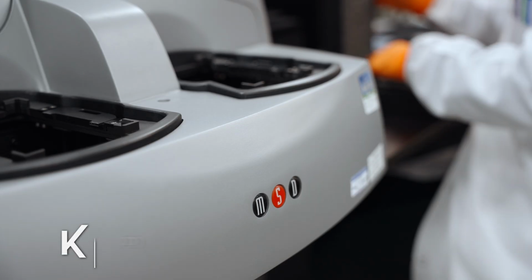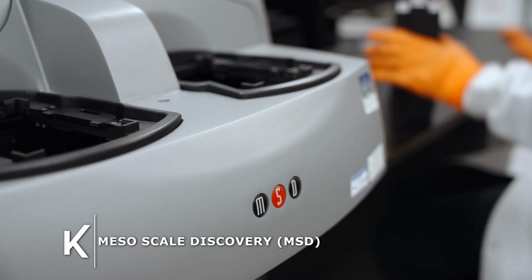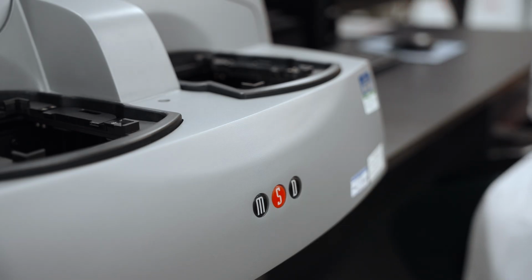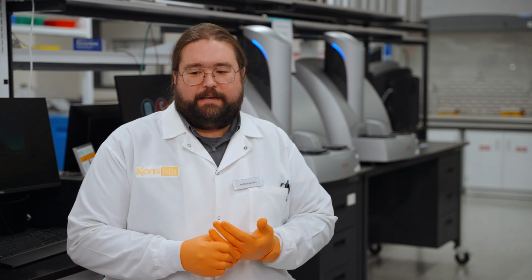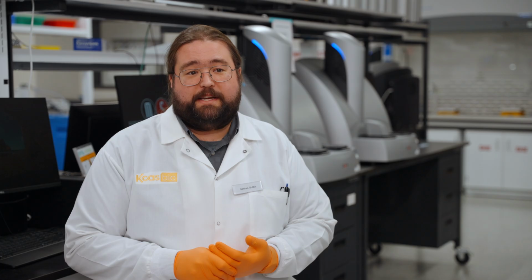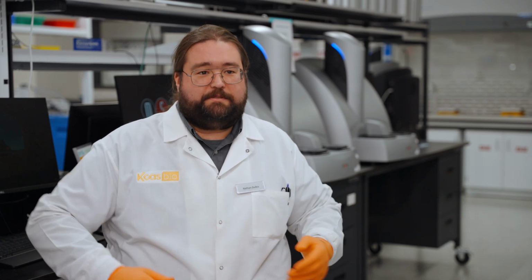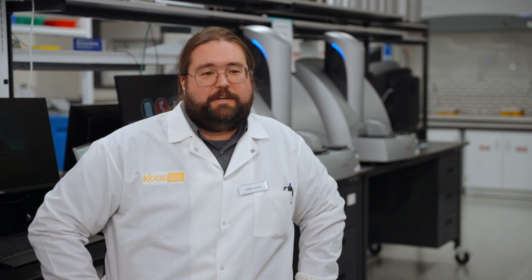This is the Meso Scale Discovery S600 sector imager, also known as MSD for short. It's an electrochemiluminescence platform. It's another readout for a plate-based ligand binding assay. So what that means is if you're doing early candidate selection for antibodies for your assay, great, you can pair them up capture detection. If you're working in preclinical space, if you're working in the clinical space, these machines support everything from the early discovery work to phase 3 sample analysis and going to new drug approval.